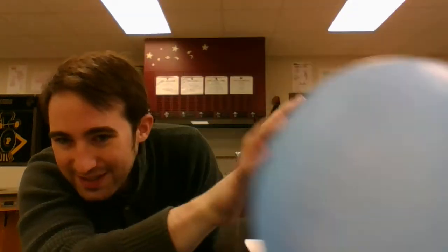Now in the thinner parts of the balloon, you can try and kind of look in here. But I mean, we can't really see a lot of gases anyway. Carbon dioxide and dinitrogen are both colorless. They're clear. They're see-through. And even as I breathe out, I'm not letting out like a color of something. You can't see it. So that might be able to help you figure out what kind of mixture this is inside the balloon. Is it a homogeneous mixture or is it a heterogeneous mixture? If I can't see those different components, it all just kind of looks like one pure substance, or it doesn't even look like something because I can't see it.